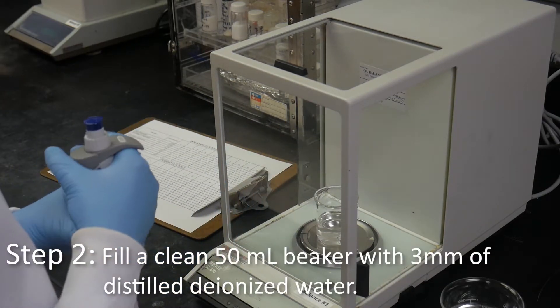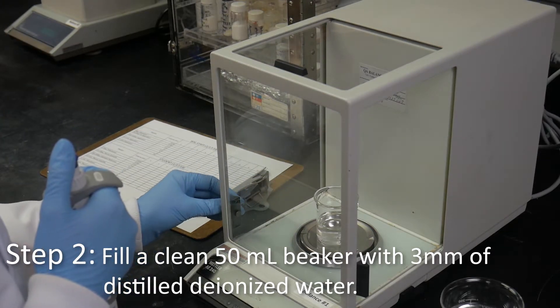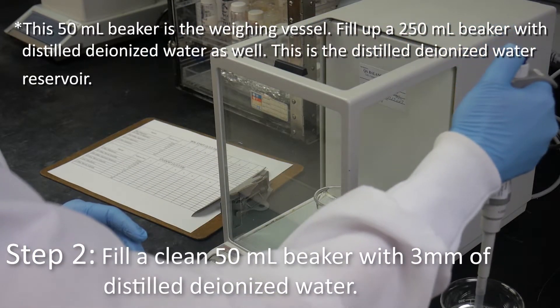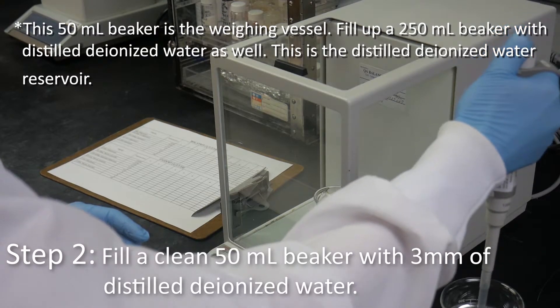Fill a clean 50 milliliter beaker with 3 millimeters of distilled deionized water. This 50 milliliter beaker is the weighing vessel. Fill up a 250 milliliter beaker with distilled deionized water as well.